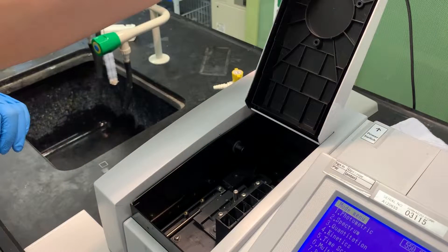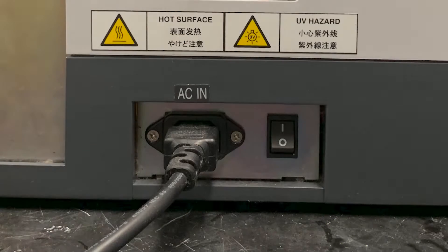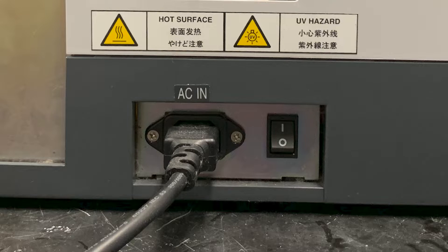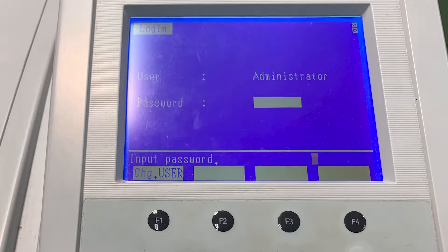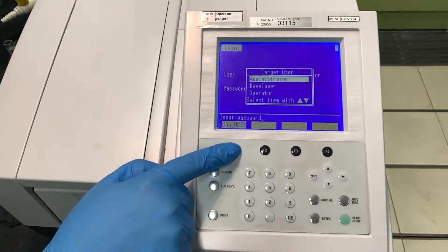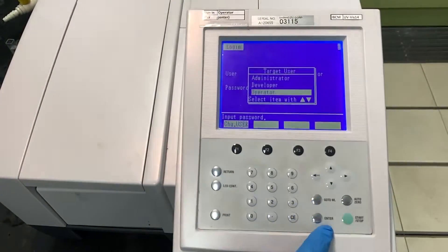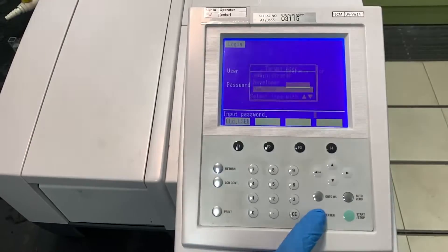Before turning on the machine, ensure that there are no cuvettes in the sample compartment. Turn on the main switch and the power switch located at the back of each unit. Wait for the machine to run the startup sequence and do not open the compartments during this time. Select F1 to change user, select operator, and press enter twice to go to the main menu.